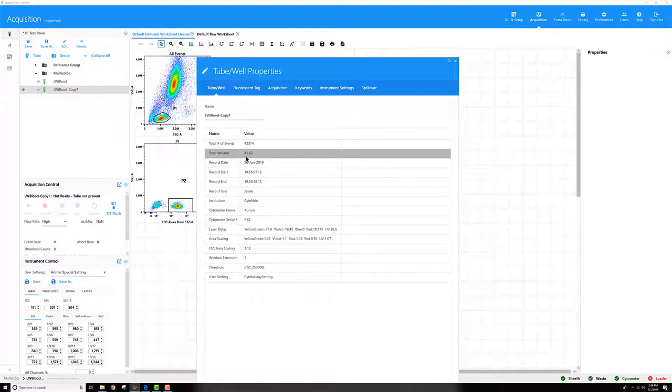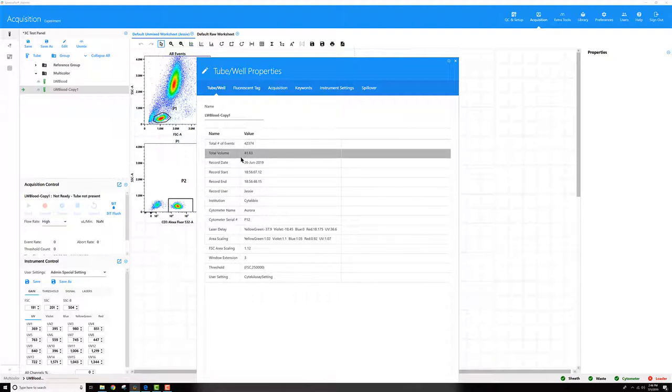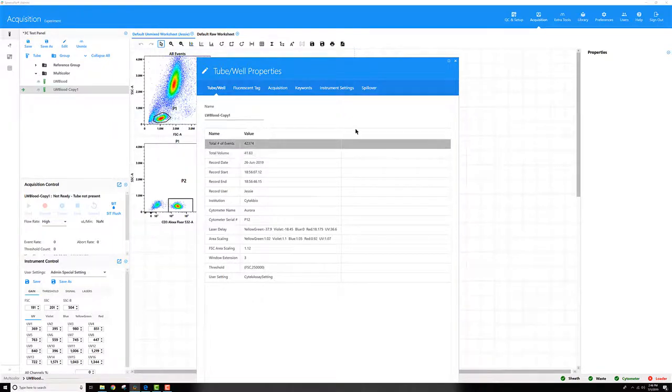What this is, is the total volume of sample that was recorded in that tube in microliters. So for this one, it was 41.63 microliters. Now, if I know my starting volume in the tube and what I did to dilute it down, I can use that information and figure out the count of cells per microliter in my sample.